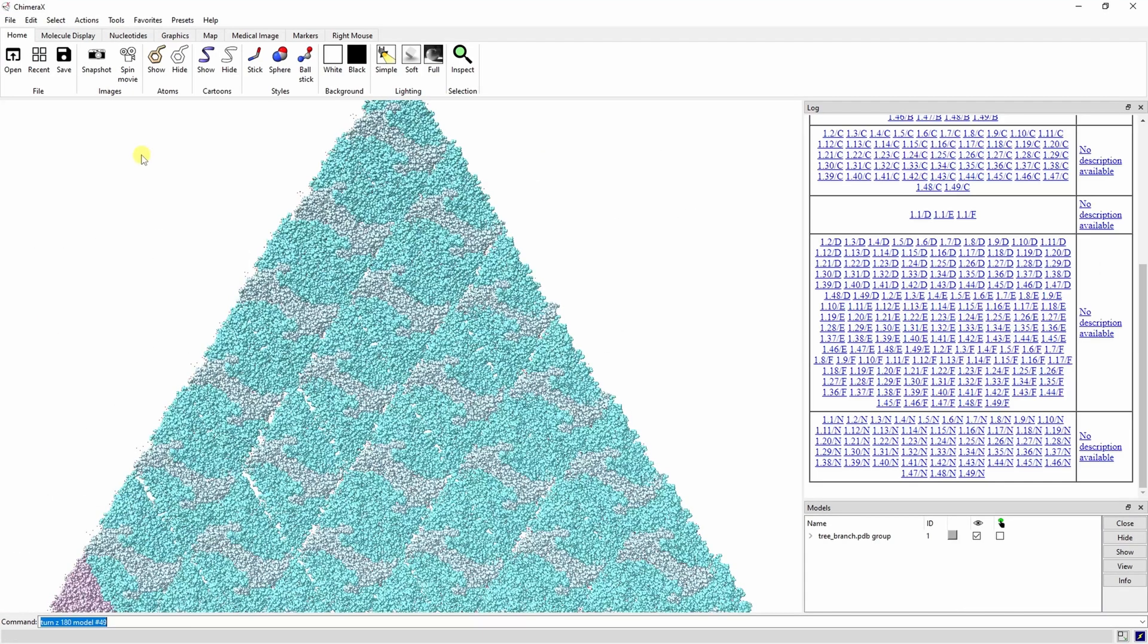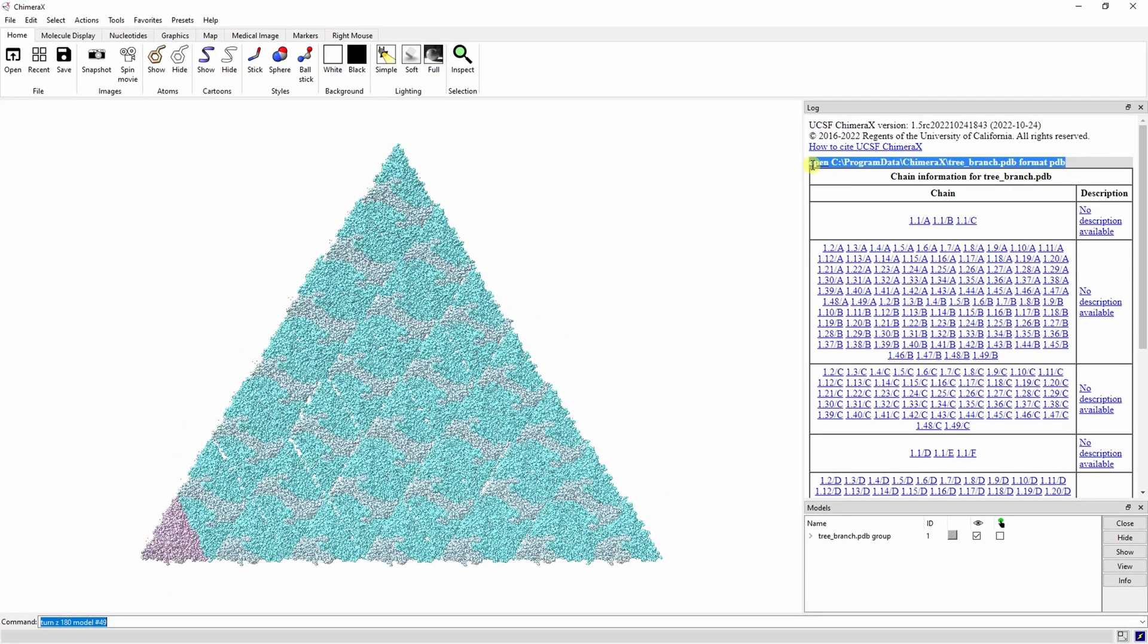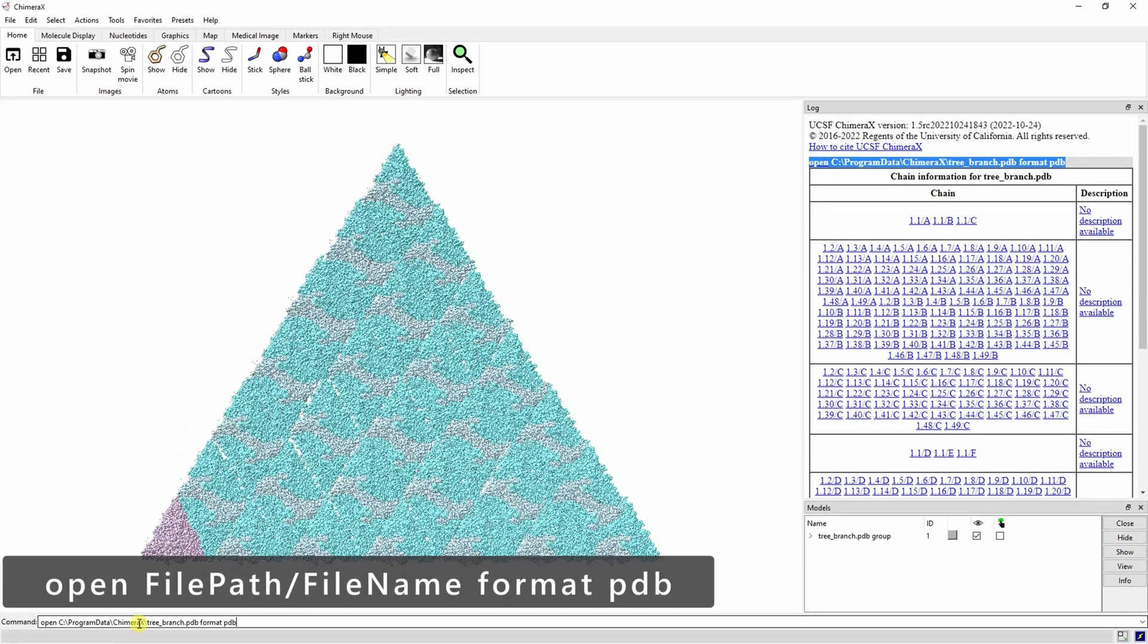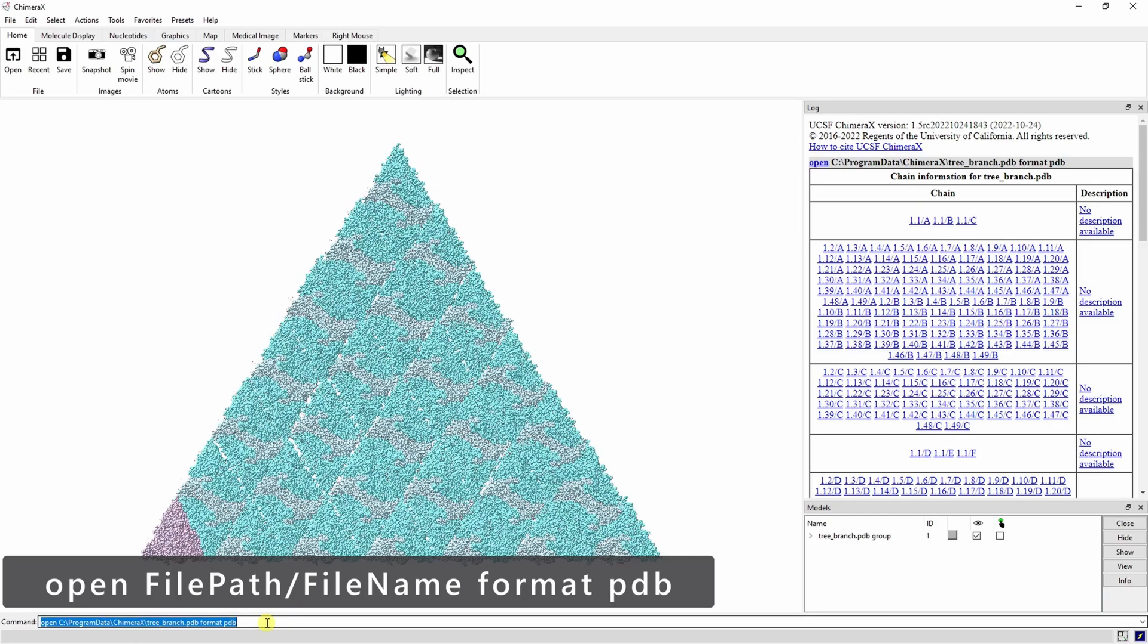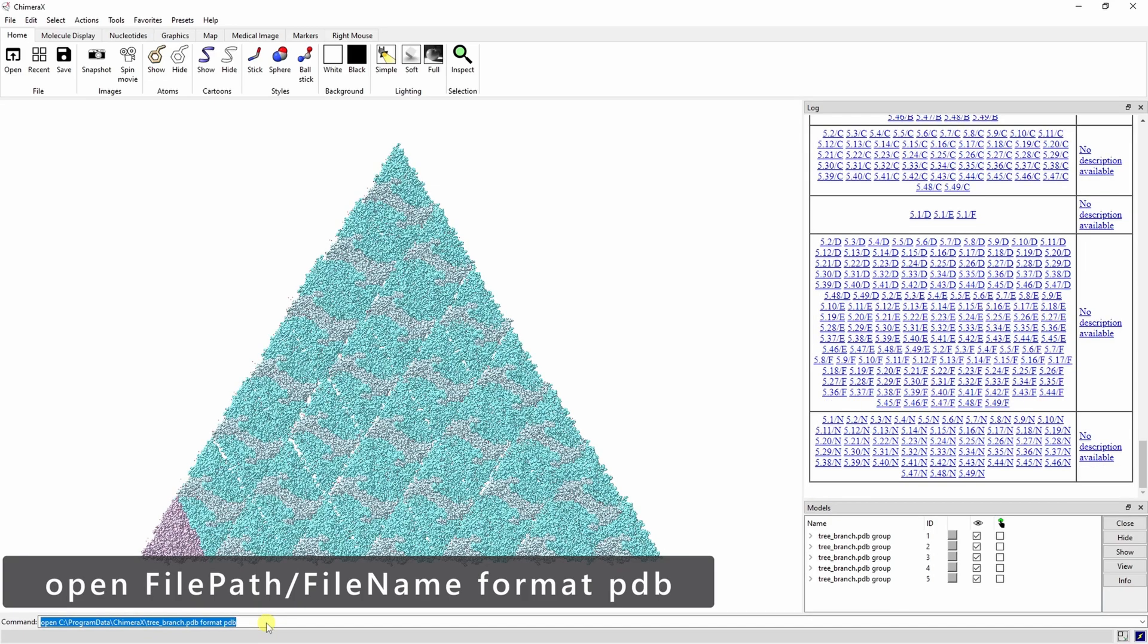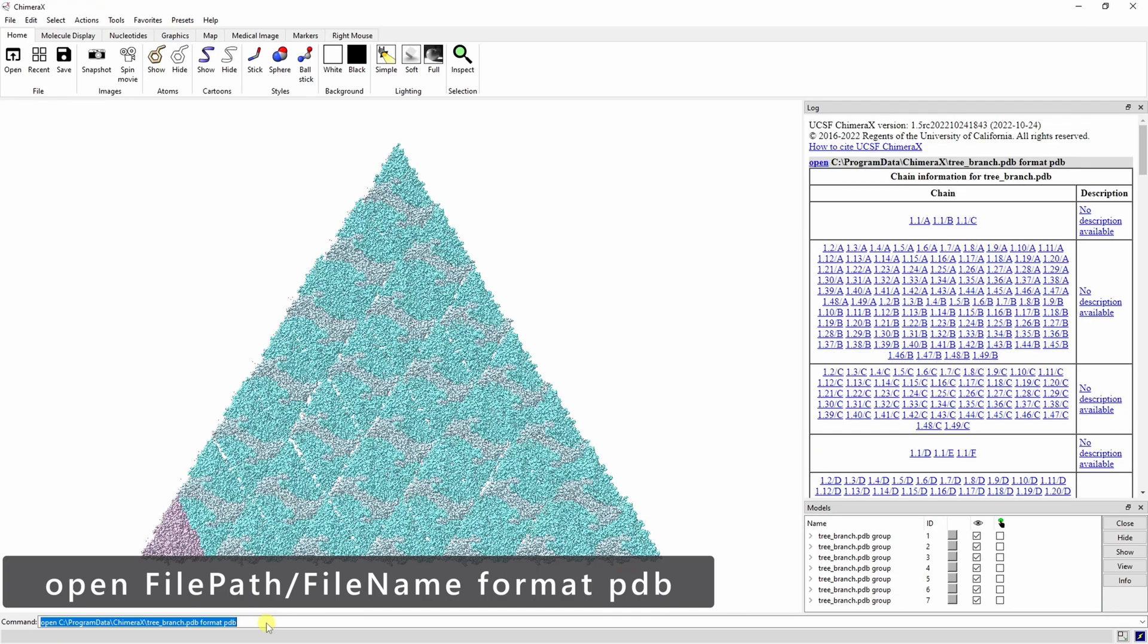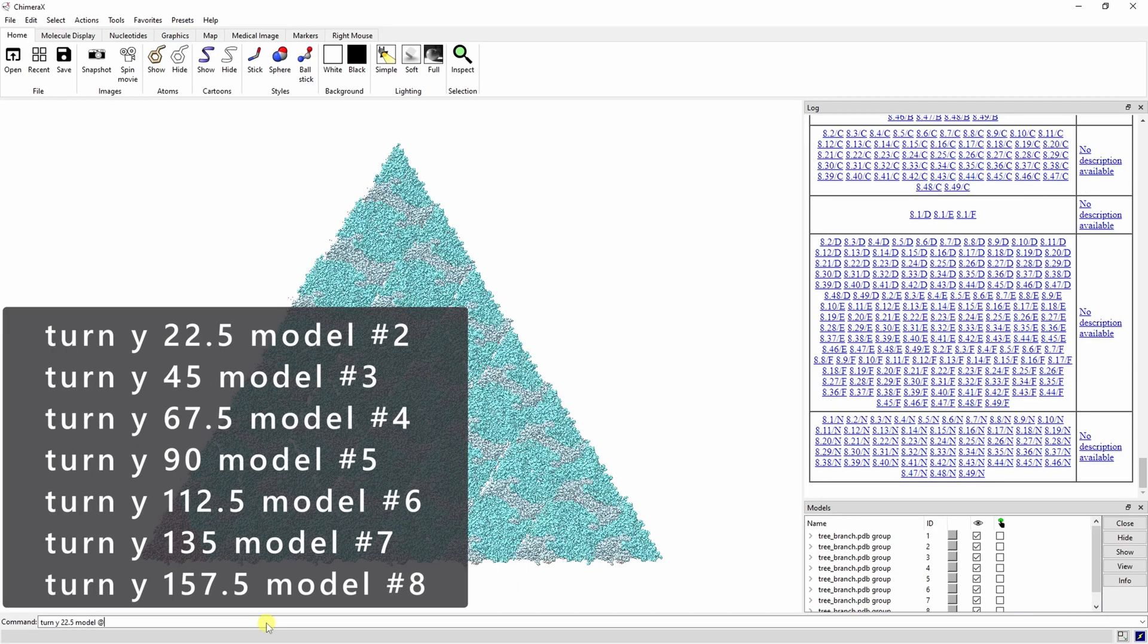Open up eight copies of this PDB in a new session. You can open up this local PDB from the command line by typing open, the file path, the file name, and specifying the format as PDB.